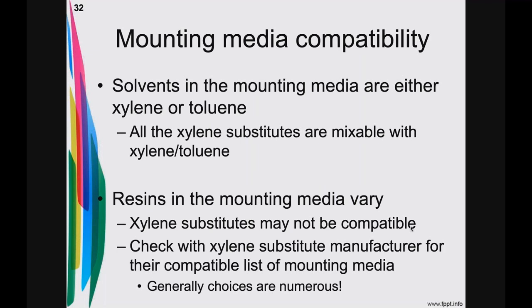So what about the mounting medias? Are the mounting medias you're using totally compatible with the xylene substitutes? Well, we know they are with xylene because they were formulated to work that way. The mounting medias you use have a resin in them, and that's what's drying up, but the resin is dissolved in either xylene or toluene. So that's the solvent. That's the liquid of the mounting media. Xylene and toluene are going to be totally compatible with all the mounting medias. I mean, all the xylene substitutes, liquids with liquid.